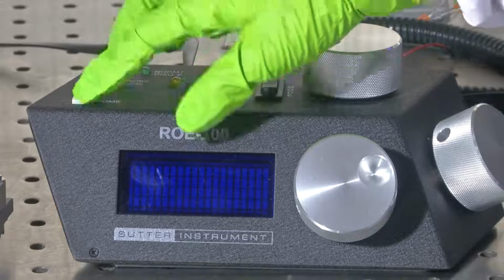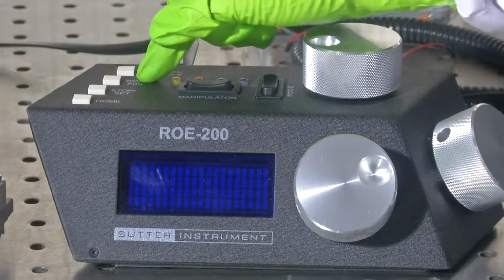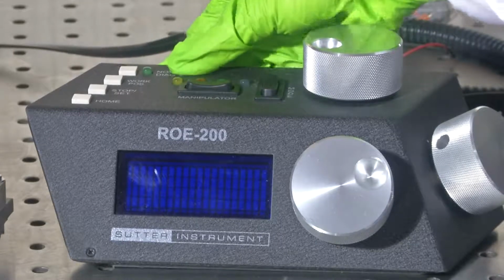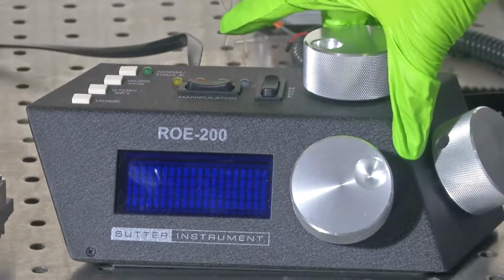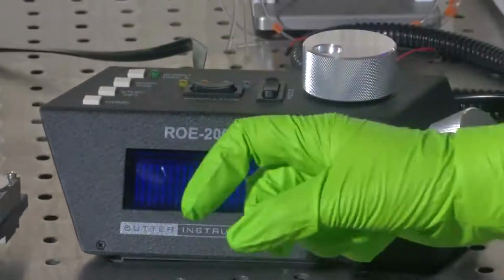And then there are different options: home, stop, set, work position, normal or diagnostic. The diagnostic is mainly to perform the calibration for the device. Work position: the feature of this entire setup is you could save your work position.